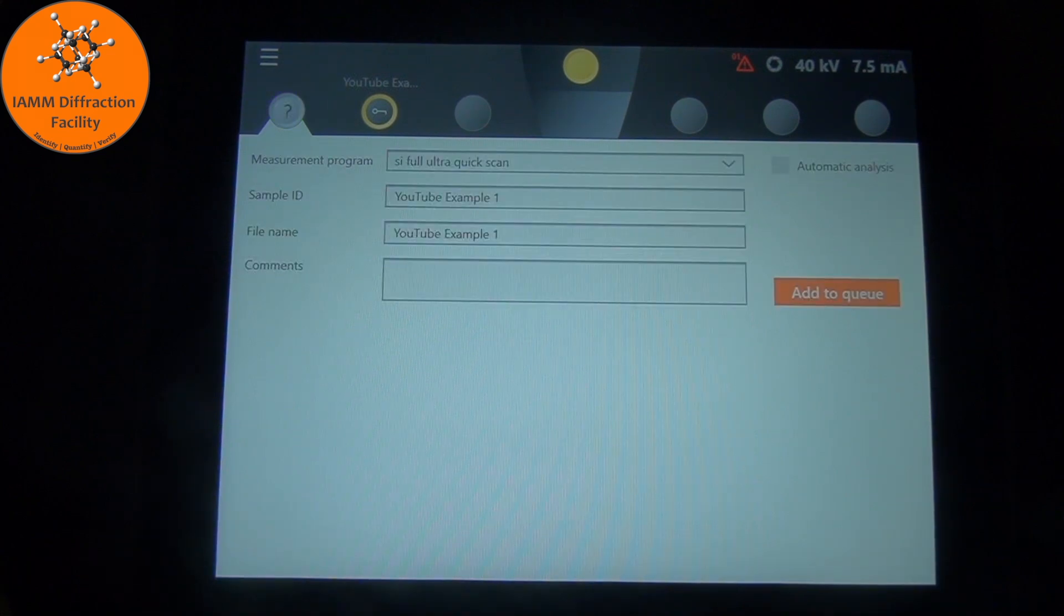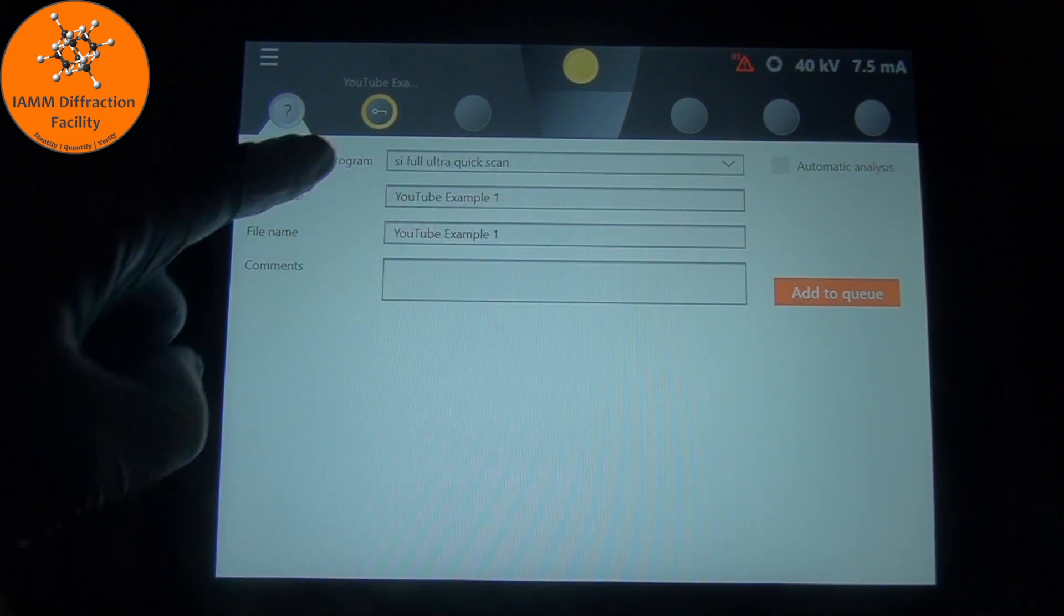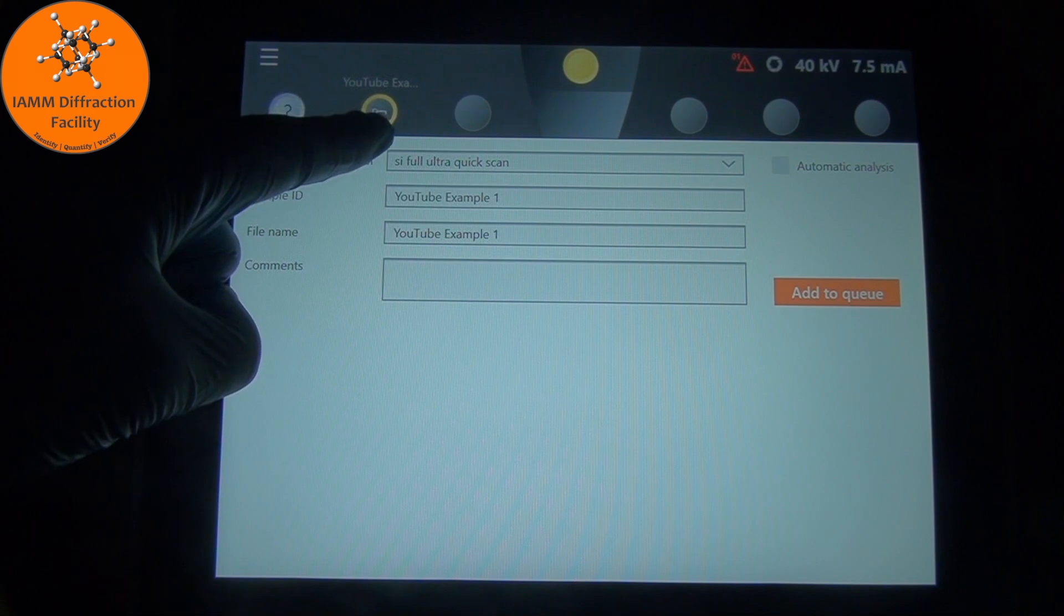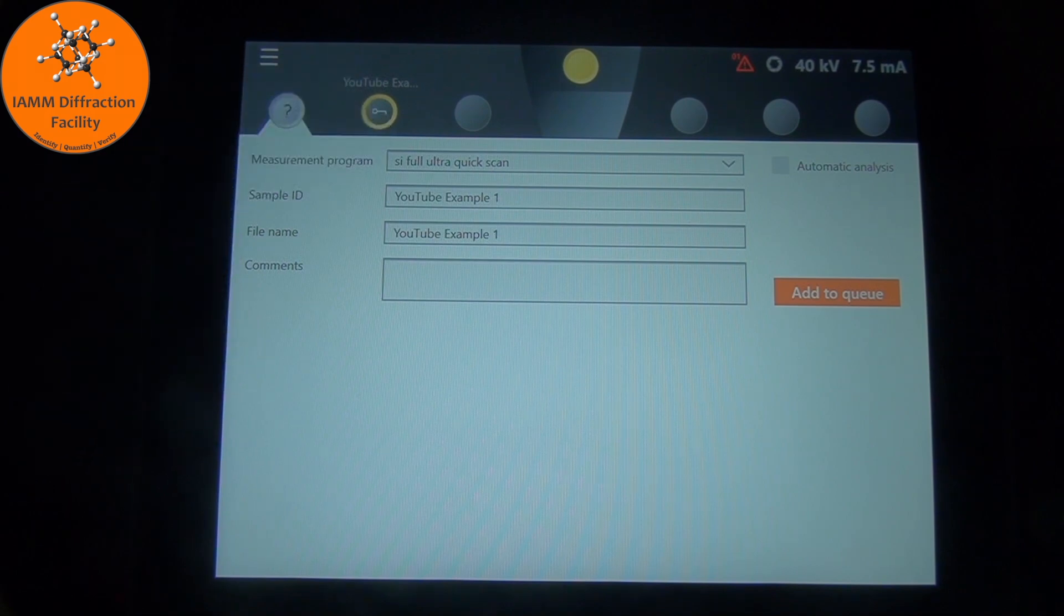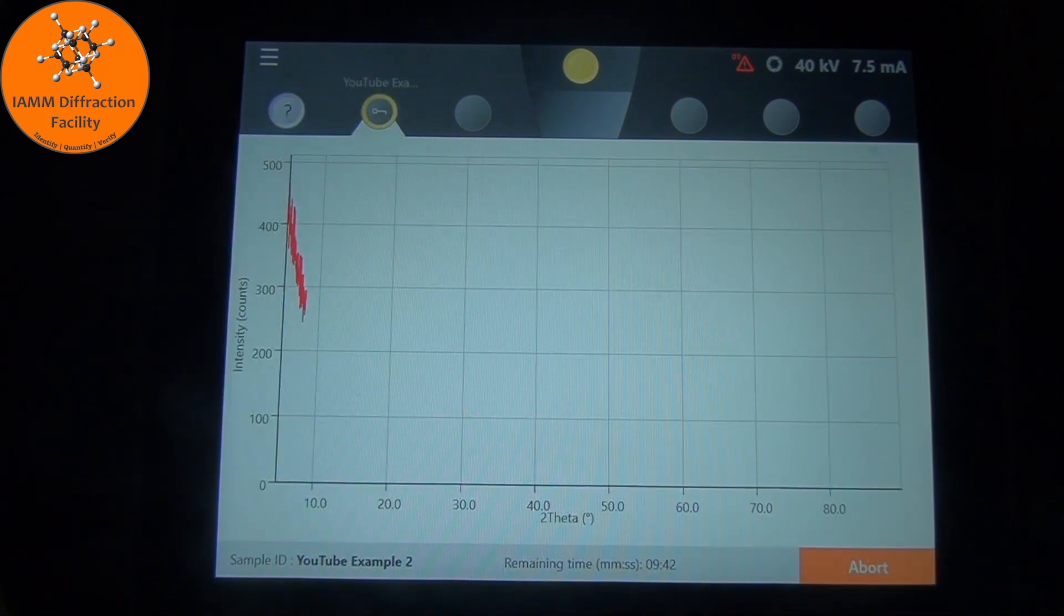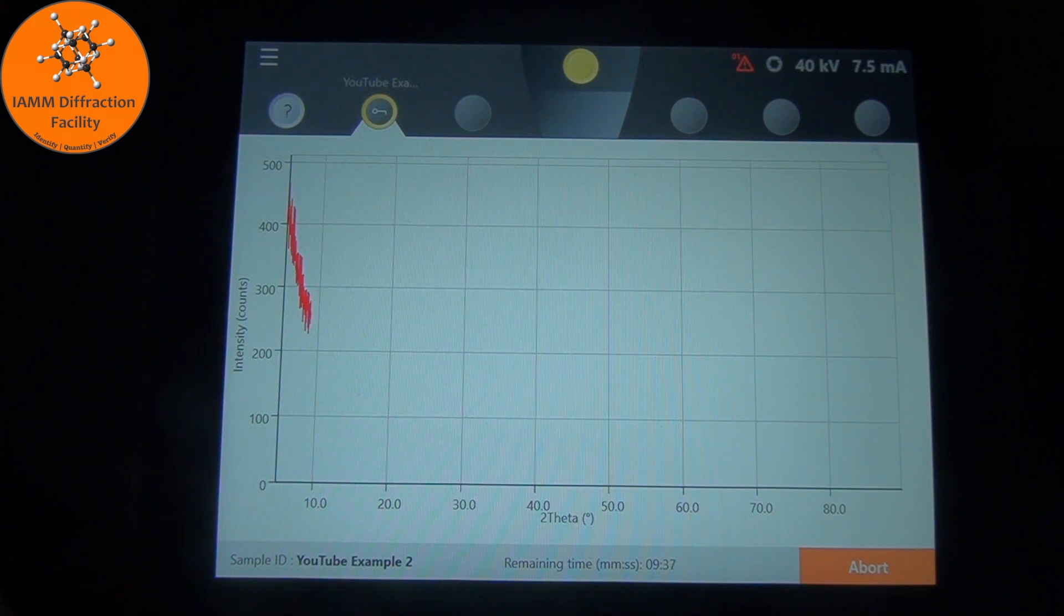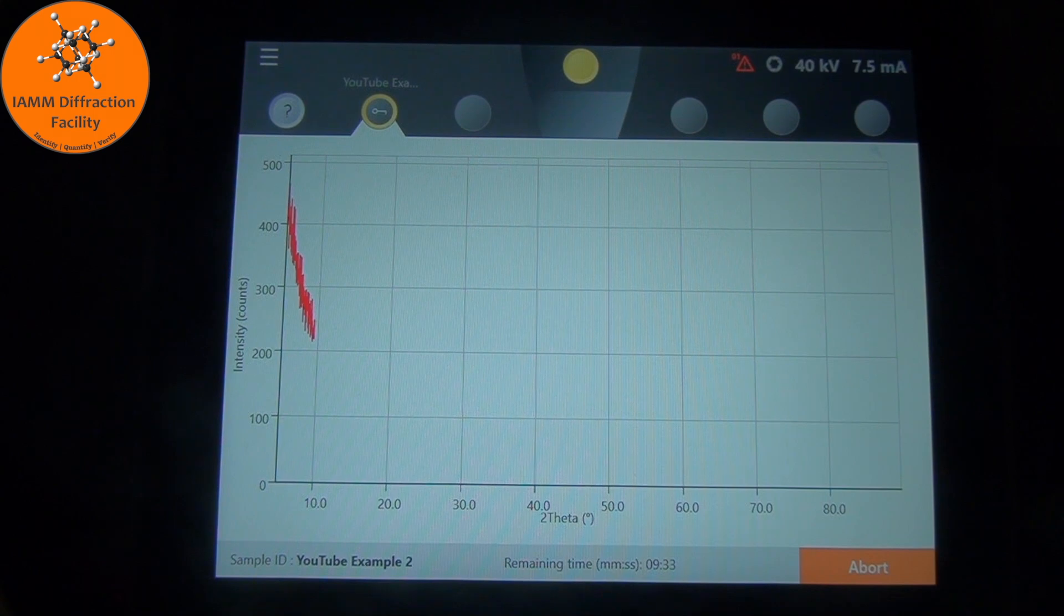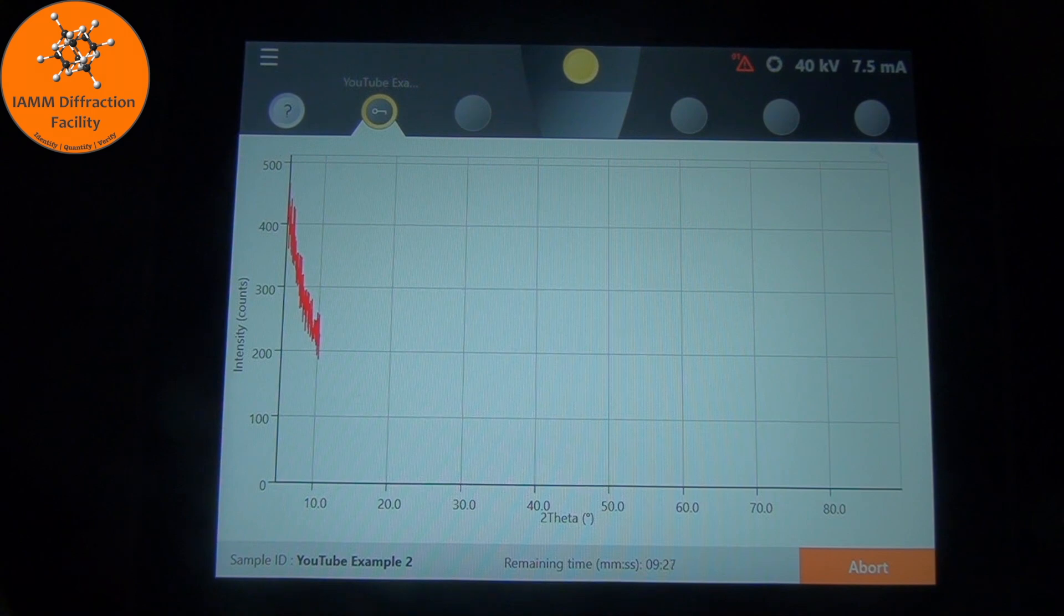We see that there is a yellow circle there for the second position. So that means that something is running there. So we will click that. We see the data collecting. Down here on the bottom, we see the remaining time for the experiment. We also see on the bottom right the abort button. So if you need to stop it early, you can click that.